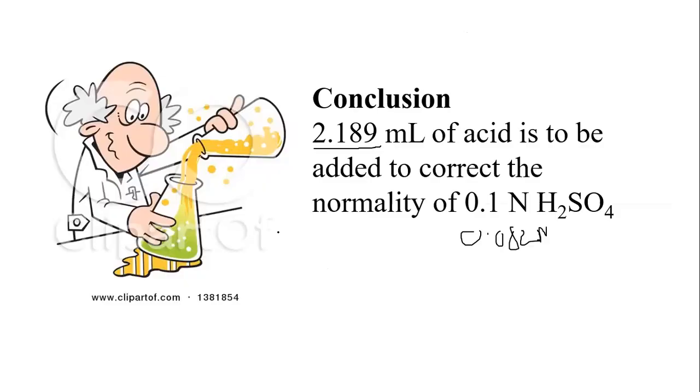But as I said, dealing with acid is very difficult. Even adding this amount of ml of acid to our distilled water is very difficult. So practically it is very impossible. Exactly, we can't add it. So to avoid that, as I said previously, we will add more acid, as in my sugar and water example. So we will add more acid and then we will add distilled water. Adding distilled water is very easy when compared with adding acid.